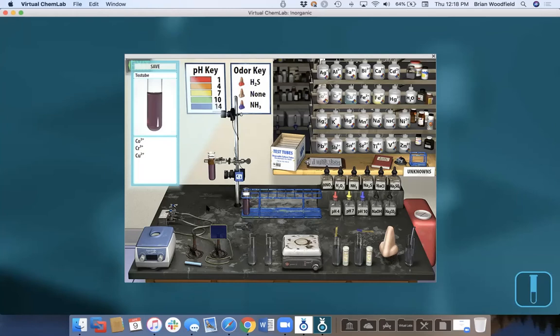It's kinetically based in the sense that some reactions might be slow. They may add a reagent and the solubility tables may say you're supposed to get a reaction. Calcium sulfate's a classic. It's insoluble, but it takes 3 days to form the precipitate. So we don't show that precipitate unless you heat it up, for example. All of that real chemistry is going to be in here.